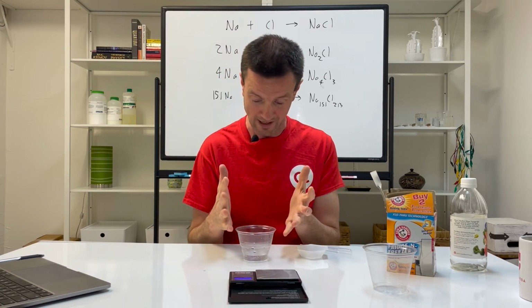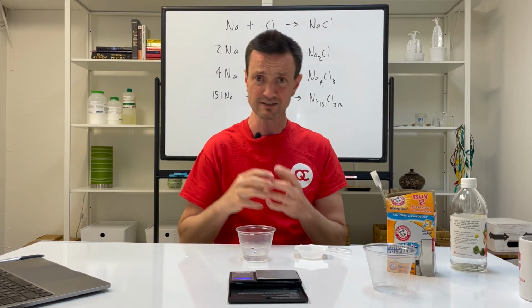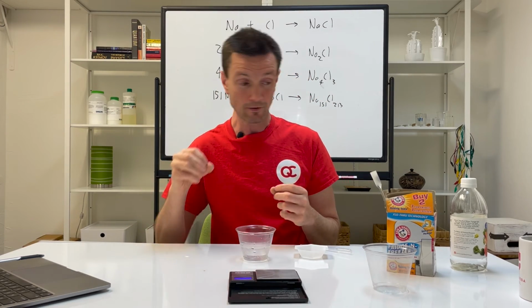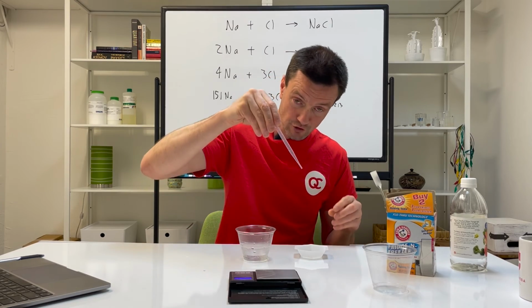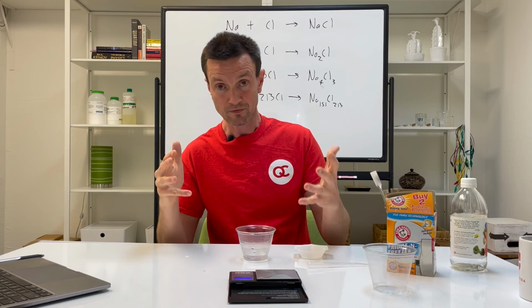So after this has reacted, step 4 says just take a small pinch of baking soda, drop it in, see if it reacts or not. Step 5 says take just 1 or 2 drops of vinegar with your pipette, drop it in, and see if it reacts or not.